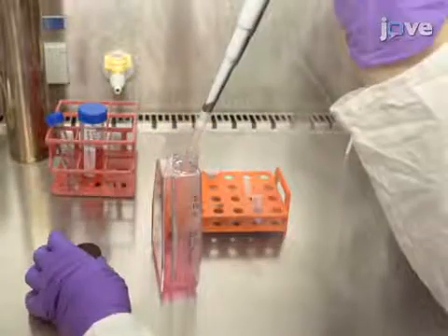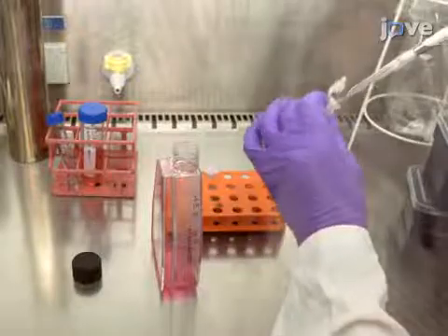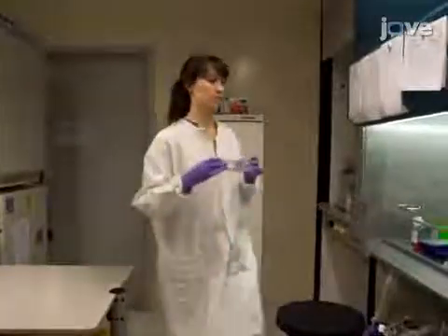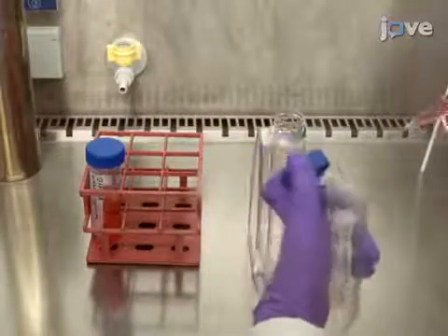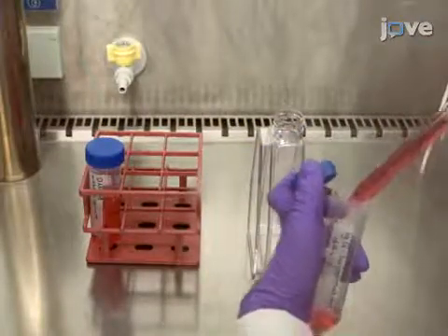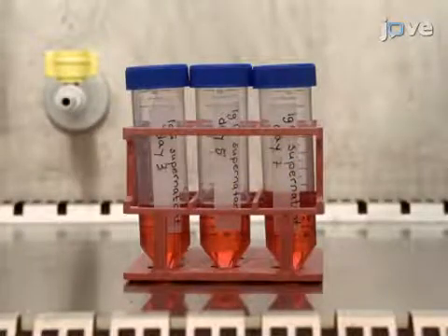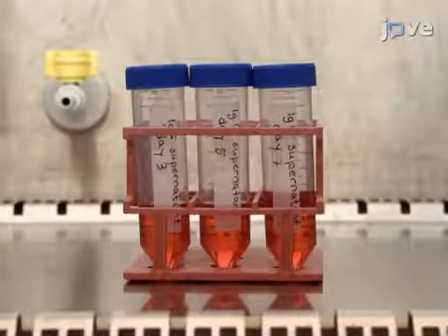Gently add this mixture to a plate of HEK cells and swirl the solution over the plate. Incubate the plate overnight, and then begin collecting the culture media every day, replacing it with serum-less medium. The media contains the antibodies, and it can be collected daily for 4 days.